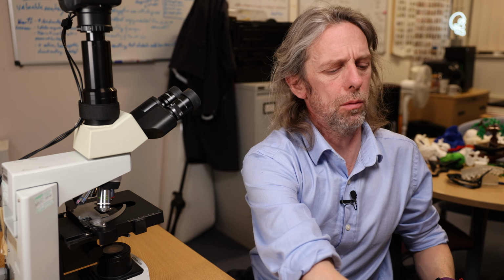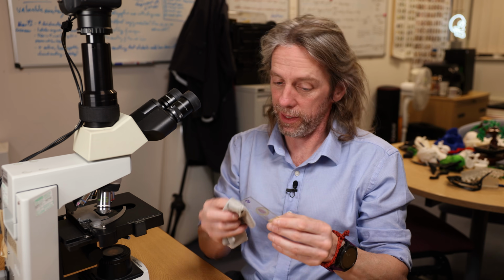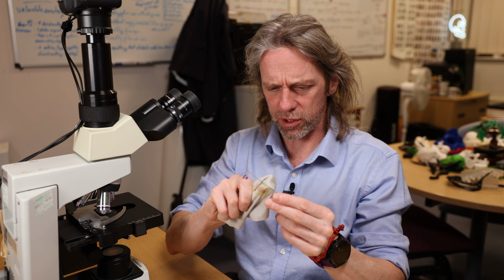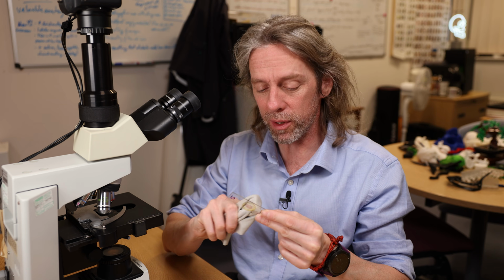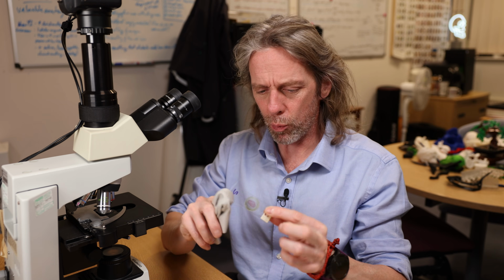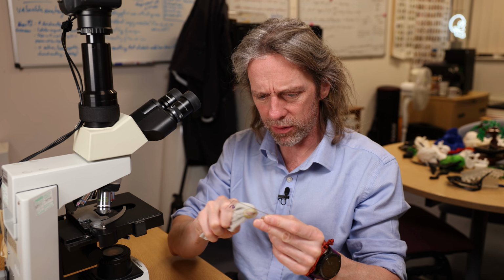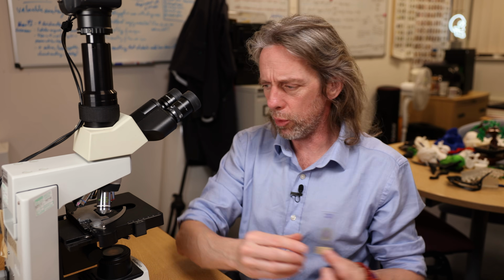Okay, so we should clean the slide. We should look at the overall structure of the ovary first. Will only take a minute, and then we'll dive in and see what we can see and work our way through the timeline of the oocyte, right?